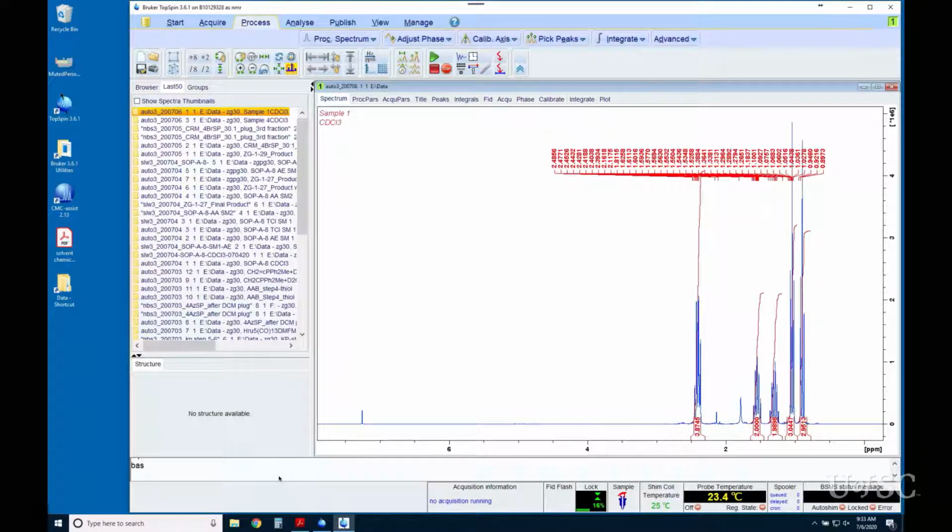Icon uses the command pps to create peak labels. This uses hidden parameters to select the threshold and detection sensitivity. For many spectra, the default values will be fine and no further action needs to be taken. However, the pp command will give you an opportunity to change these parameters and help define the peaks you would like to label.